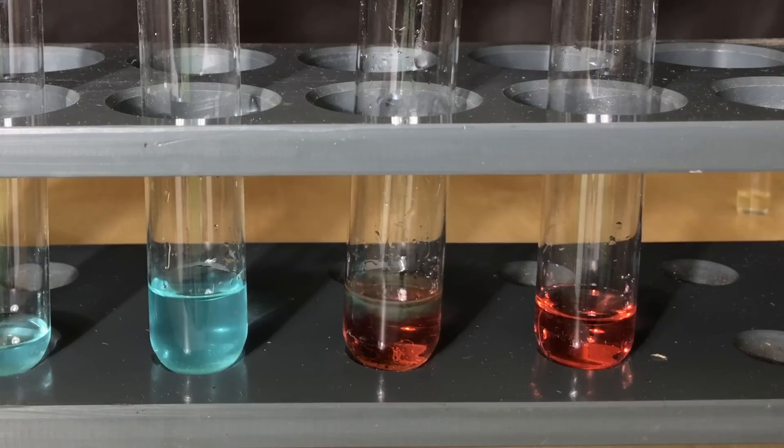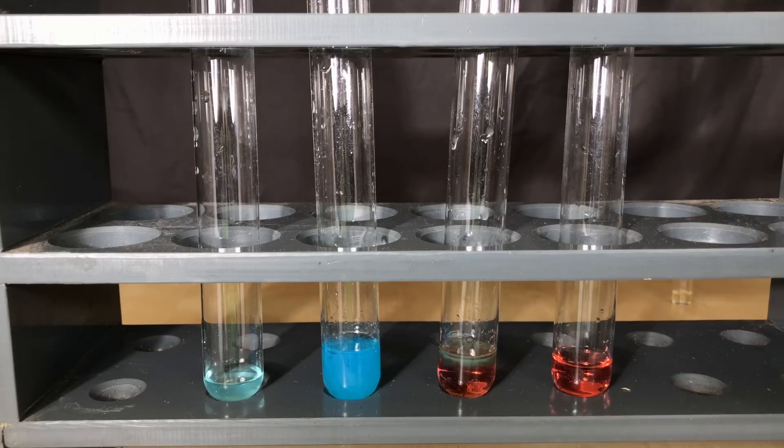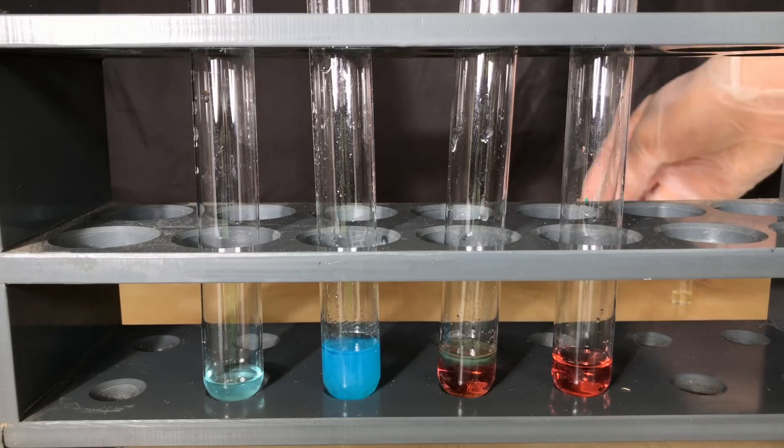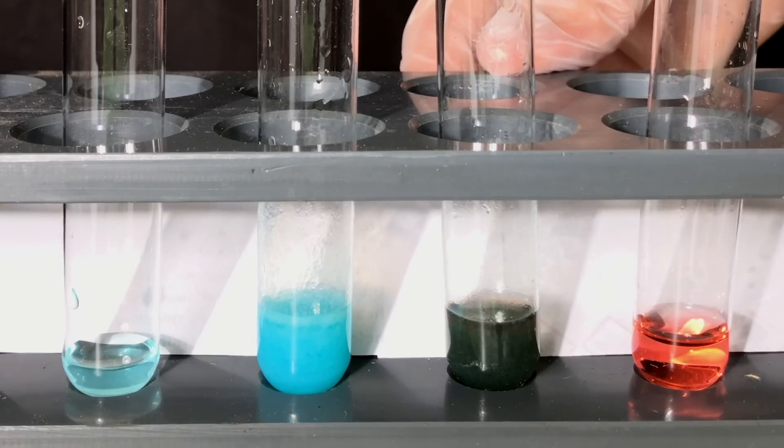With the cobalt, some sort of brown complex was being formed. With the copper on the other hand, we got a light blue complex that seems to be insoluble. I gently shook the test tubes and the color of the complexes became even more visible.